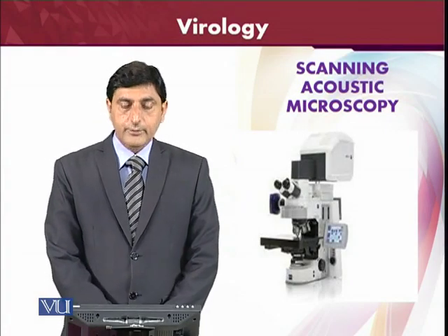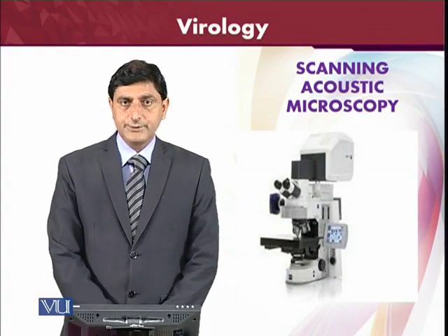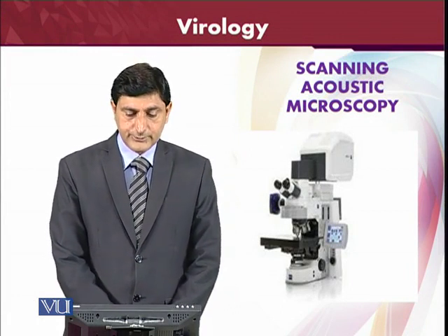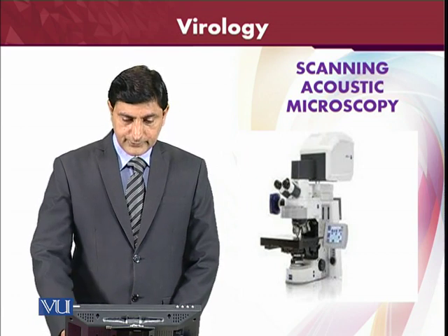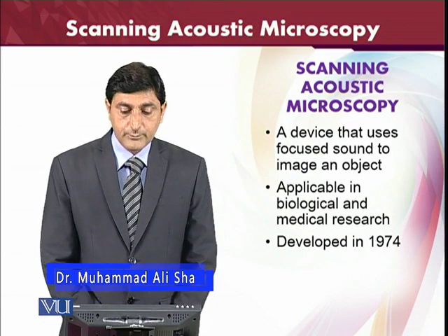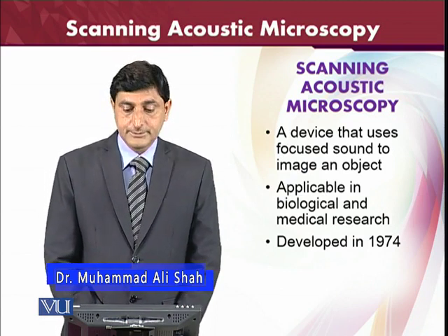Now the scanning acoustic microscopy. This kind of microscopy is used along with the scanning electron microscope, and this is also a very complex and very expensive type of microscope. A device that uses focused sound to image an object.